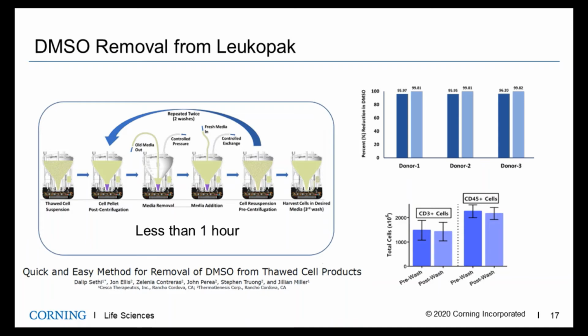Even with only 1 wash step, I'm not sure if you can see the numbers, the DMSO concentration was reduced by greater than 95%, which for most applications is likely to be more than sufficient when you take the subsequent dilution and formulation steps into consideration.